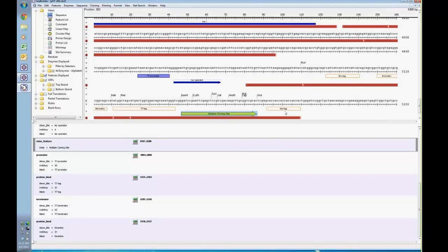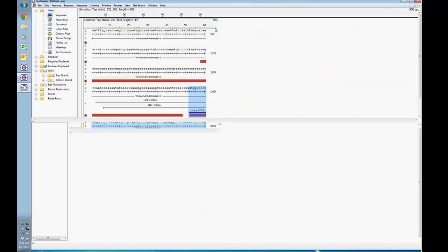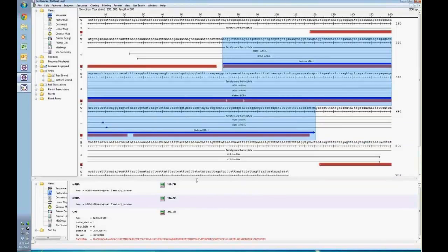I could also potentially manipulate the sequence string here to put a terminator before this histidine tag, and that would be even better. But for today, we're simply going to utilize the NdeI and XhoI restriction sites for this cloning strategy. Okay. So we're going to maximize that nucleotide here again, and then I'm just going to walk you through the steps to add those sites onto the ends of that target.